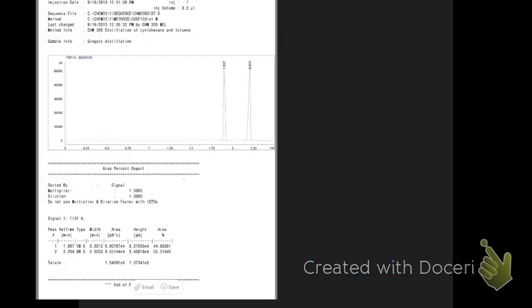How are you guys going to see this? You are going to be receiving a plot that shows you that trace that I just kind of hand drew, and then underneath there's going to be some data. So let's focus on the plot first that's on the top half of that screen.